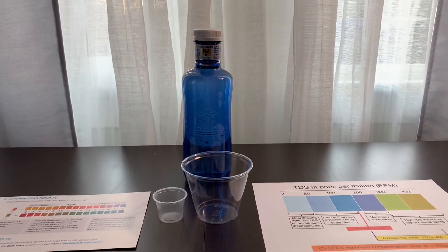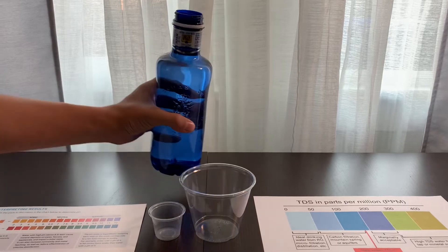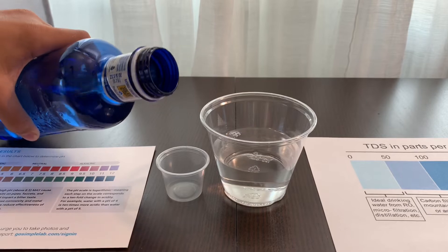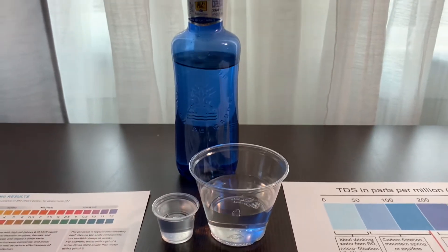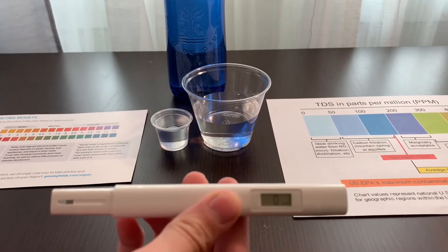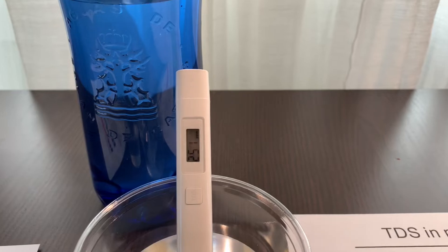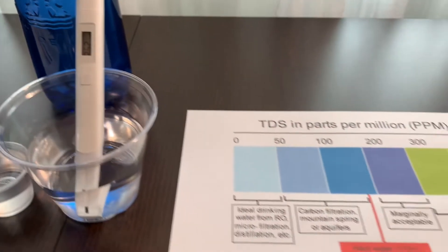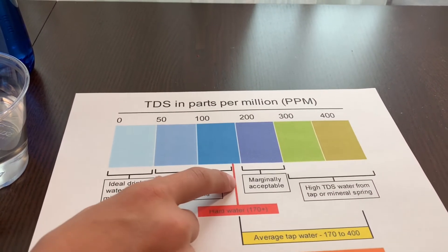Let's test the pH and TDS levels. Let's pour some water in. First, let's test the TDS level. Turn on the TDS tester, make sure it says 0, and put it in. The reading is 252, which is considered hard water and it's marginally acceptable.